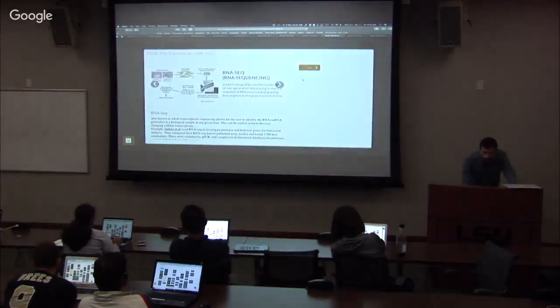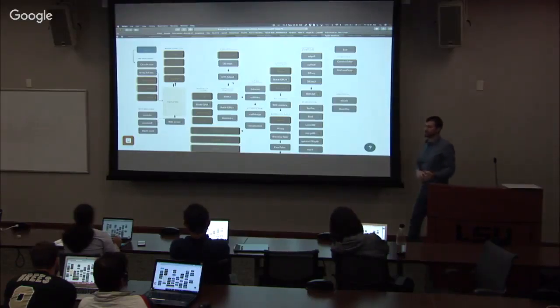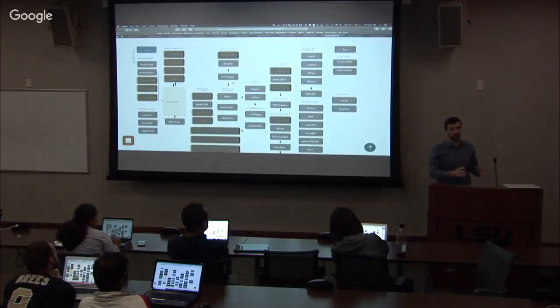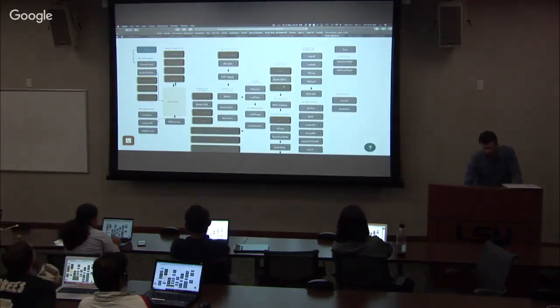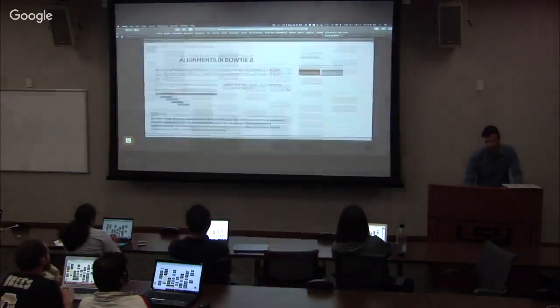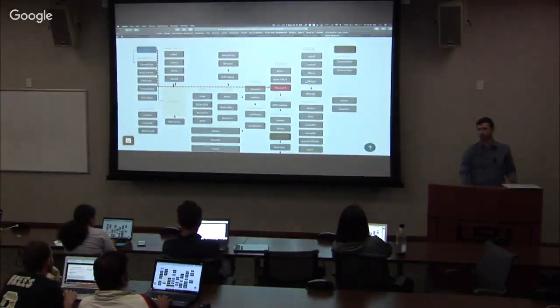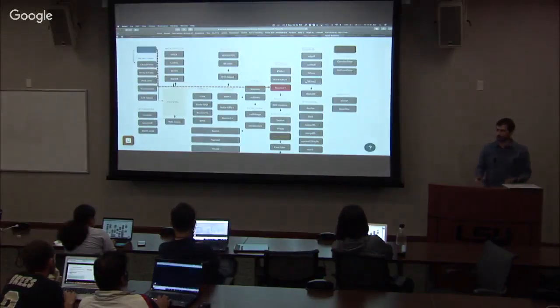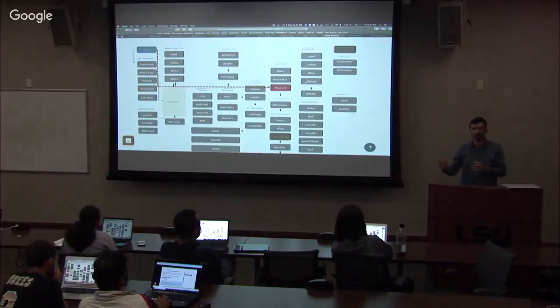So then I clicked on start, and now I have these options. So the most simple way to process these FASTQ files is just to map everything that we have on transcripts. So I can just go from start to bow tie to T, mapping on transcripts. Okay, and that would be my most simple pipeline, because now I've taken those short reads and I map them on whatever is in my Gtf file.